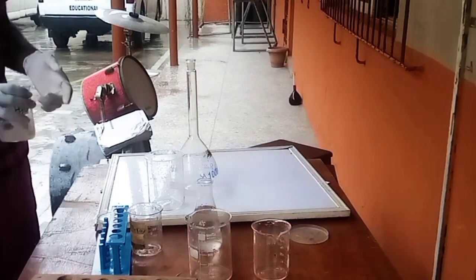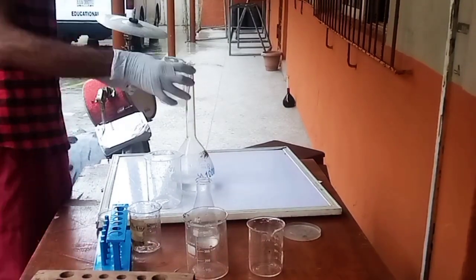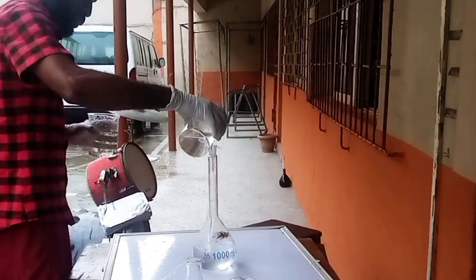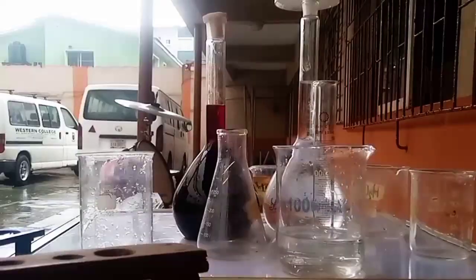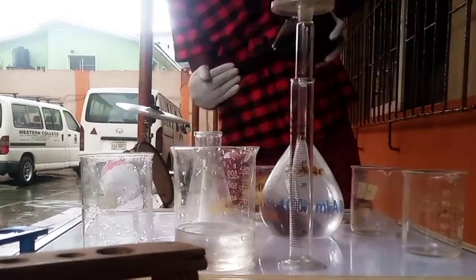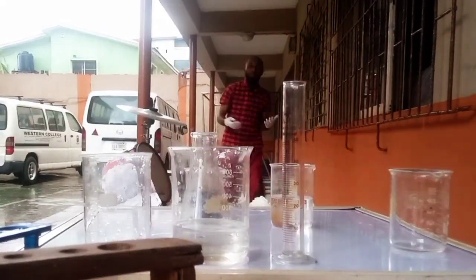And you know, this one is very, very simple, therefore I am going to fast forward it again for us here. What I needed to do here is to clean up whatever I have done here. Let me fast forward it again. Even the sodium thiosulfate, I know you can do it, therefore I'll just fast forward it directly. What I want to do here is to have a short demonstration of this without even using the starch solution here. What I normally do on this is just make use of my measuring cylinder. I'll use my measuring cylinder to do this and to check if it is possible.